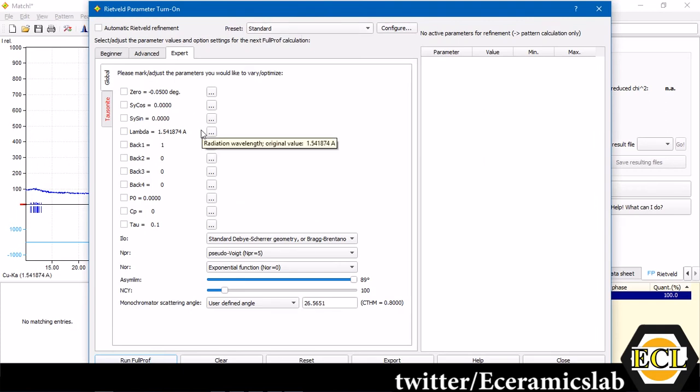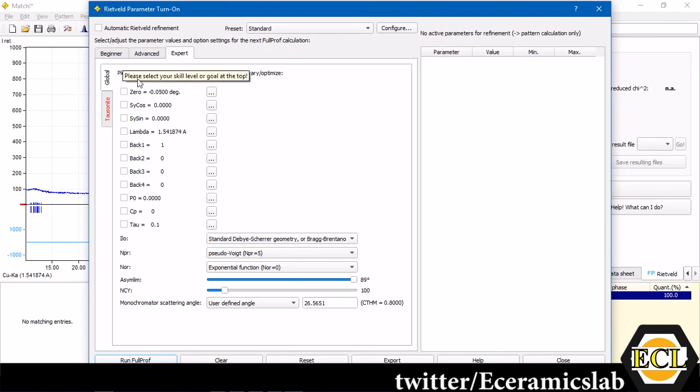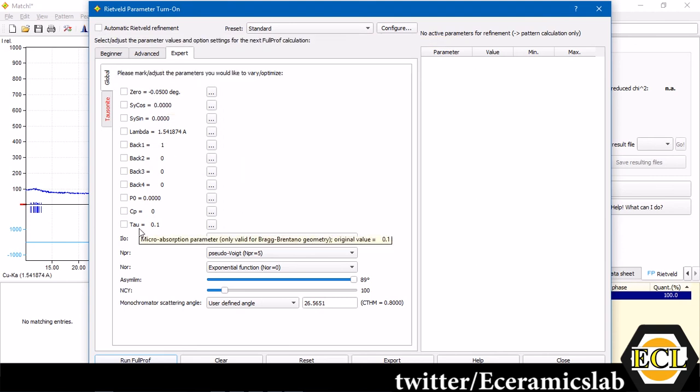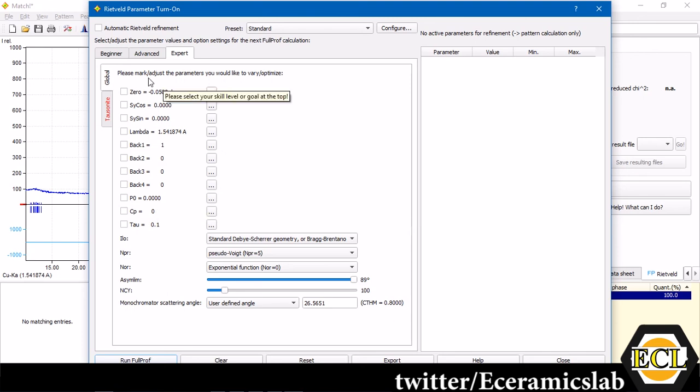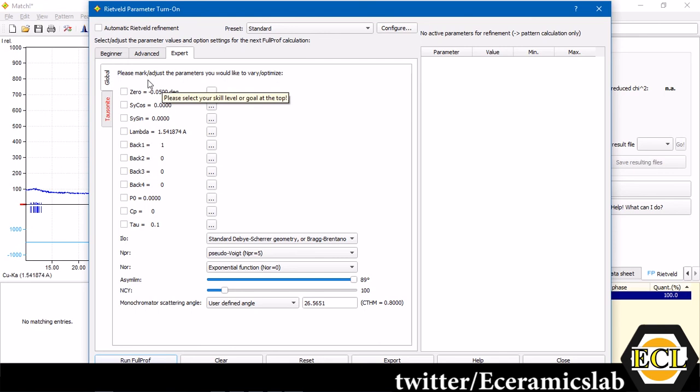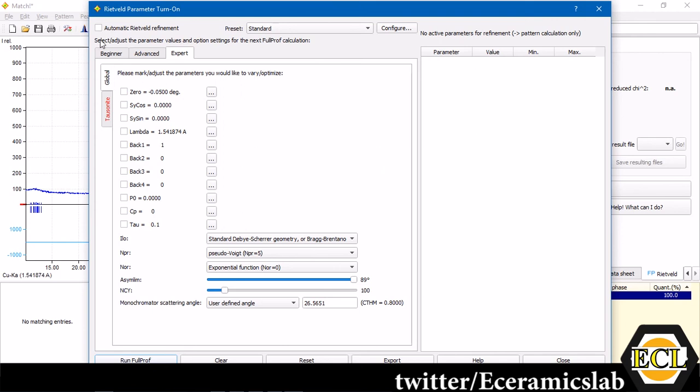As told in the starting of this video, we are going to do an automatic Rietveld refinement. Means, we are not going to have control over these parameters, background parameters, and various other parameters. Everything is going to be taken care of by the software because this is for beginners level. This is not as good as the expert mode, where you can control all the things and generate a better chi-square value. We'll select automatic Rietveld refinement and click run FullProf.